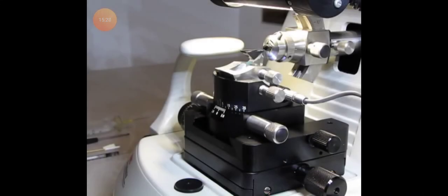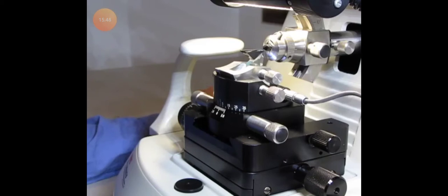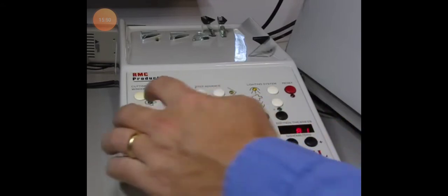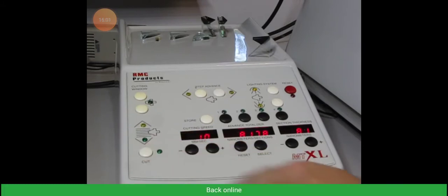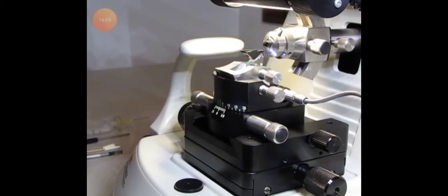Now the nice thing about this microtome is that it will cut slowly to cut the section and then return to the next cut quickly. But we need to tell it where that slow part is versus the fast part. And that's using the cutting window control on the microtome controller. Position the sample roughly 2 to 3 block heights above the knife edge and press the upper cutting window button. Then lower it so that you're just below the knife edge and press the lower cutting window button. And now you're ready to cut. I usually start a little bit thick, usually around 90 nanometers.